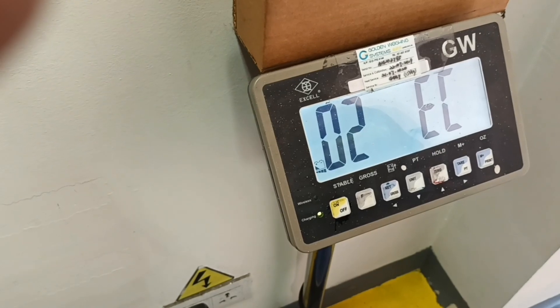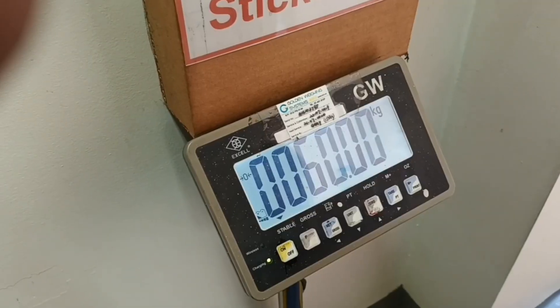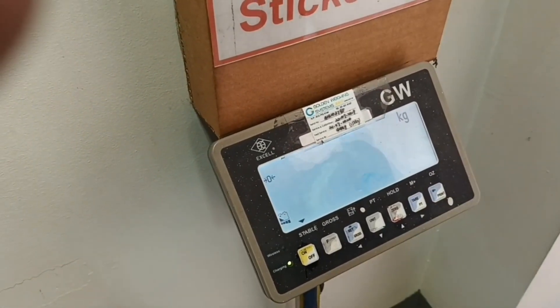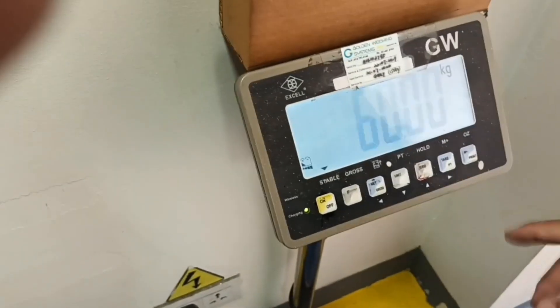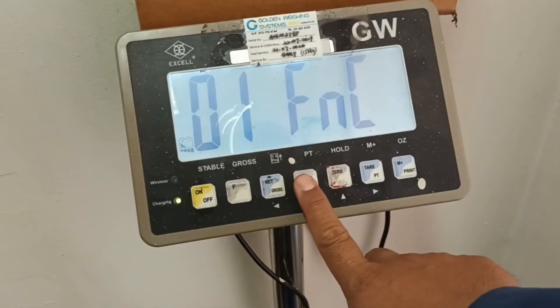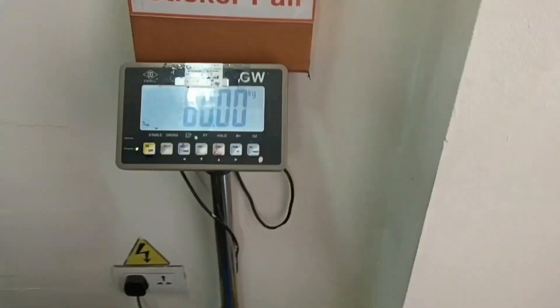...the capacity: 60 kg. I will put enter — yes, one more. Wait until... I will select 60 kg. Now I put the standard on the pan, 60 kg. Wait a moment. And now I will select.